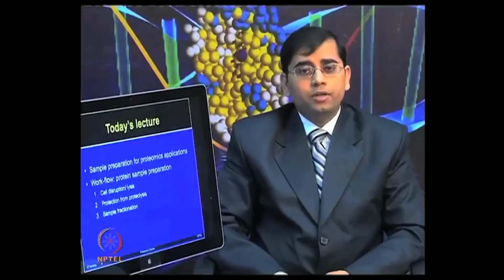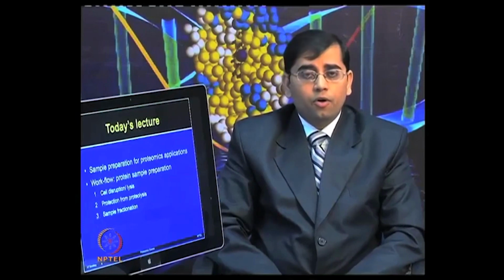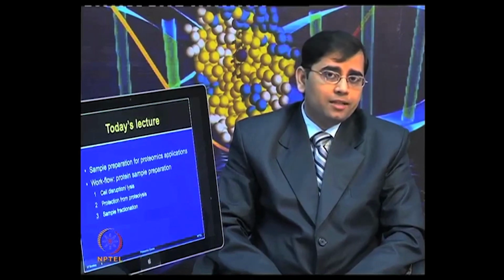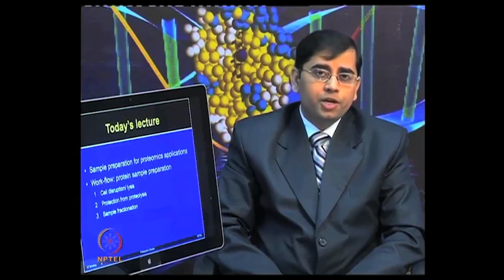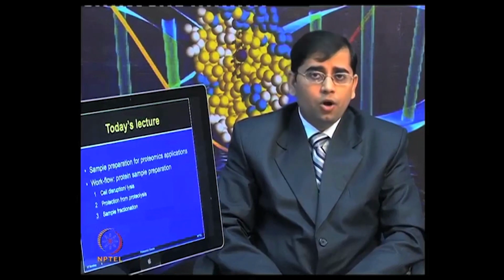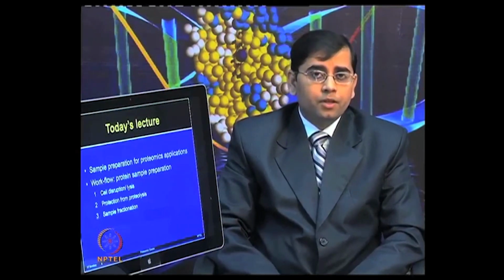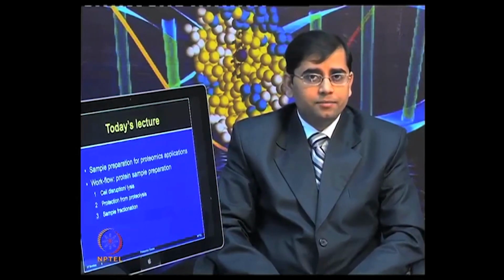Now, when we are talking about the sample preparation, this is quite generic for different types of proteomic application, whether one wants to use gel based approaches or gel free approaches. So, whether you want to use 2-dimensional electrophoresis, dyes or different types of gel based applications, or you want to perform mass spectrometry and different types of label free techniques, you have to ensure that you are starting with a very good protein extract.